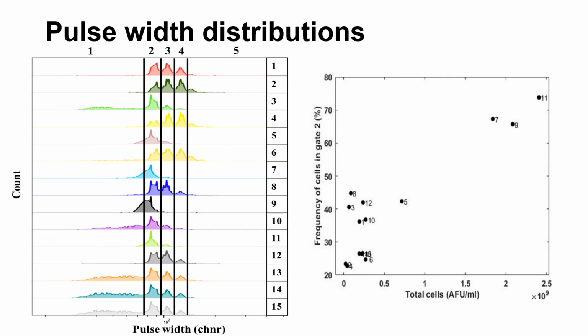This graph also gives information on the cell size. The ones which have grown well seem to be in gate 2 and seem to be smaller than the ones which have a wide spread, suggesting they were much longer.